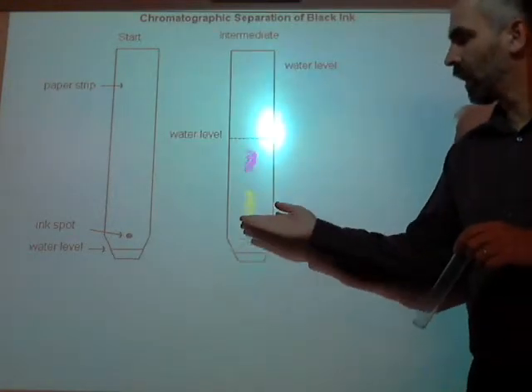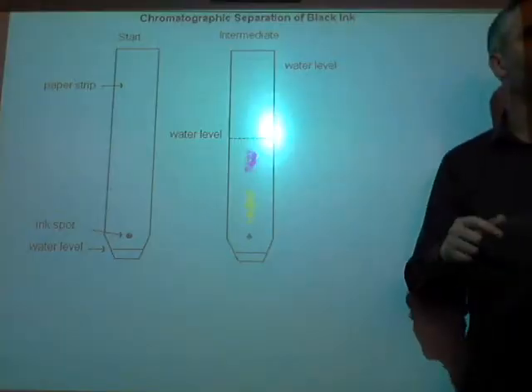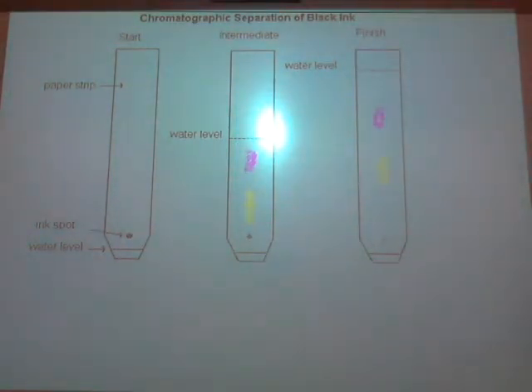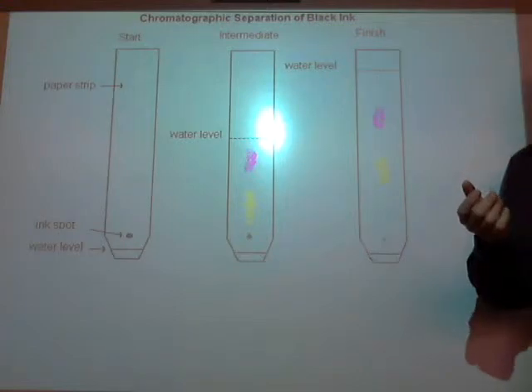All right. As they sit there and they travel, even though it started out as a black dot or a purple dot or whatever, as it travels up, it's going to separate into different colors. Over the course of the hour you're letting it sit, you will see when you're all done, different spots. I told you there's a calculation to do.